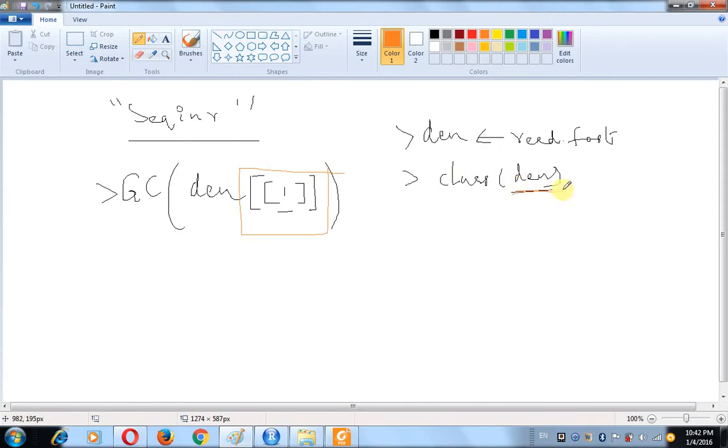and there will be levels for a list, and in case this list object den has any levels, then we can inquire them as names(den). It will let you know the number of elements that it has, element number 1, element number 2, element number 3, something.